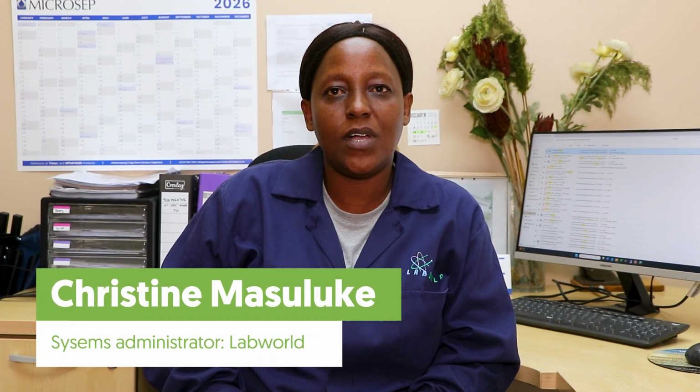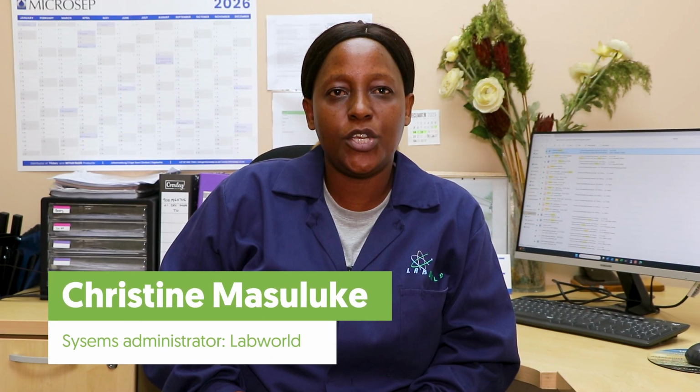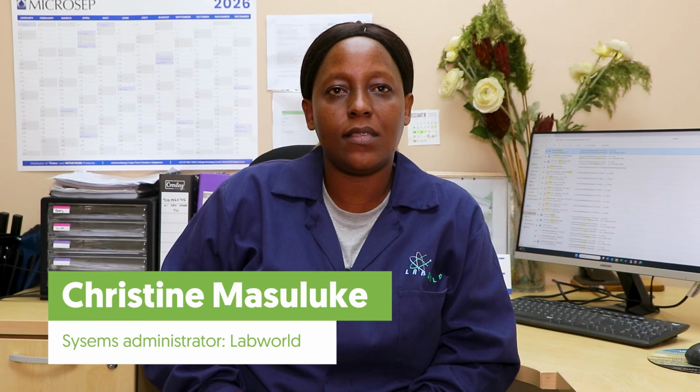I am responsible to make sure that the system is aligned with the standards and requirements, also the policies and the procedures of the company. I'm also responsible for all documentation that includes creating, managing, and updating of all documents that are used in the laboratory. Also in the compliance of the occupational health and safety system.